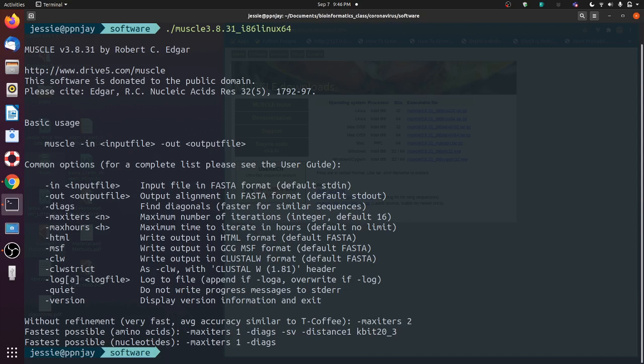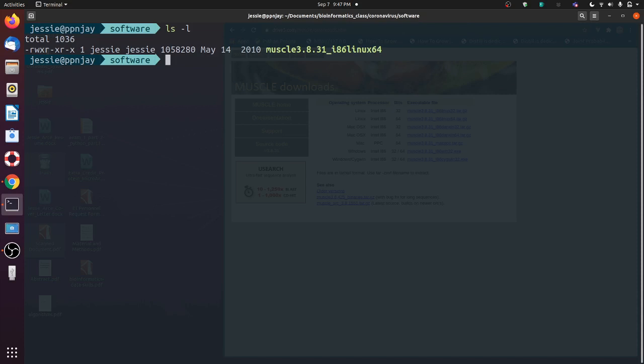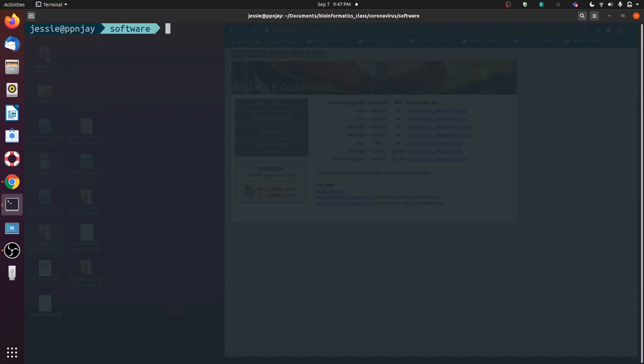I can use it. I don't need to do anything extra, and don't even need to make it executable. It's already ready because you just got the executable files, right? Didn't have to do anything extra. Now, it's the same process for Mac users. Okay, you just download that binary, untar it, and once you untar, go ahead and you can execute it. Okay, I haven't showed you how to use it from anywhere yet, but I will cover that later.